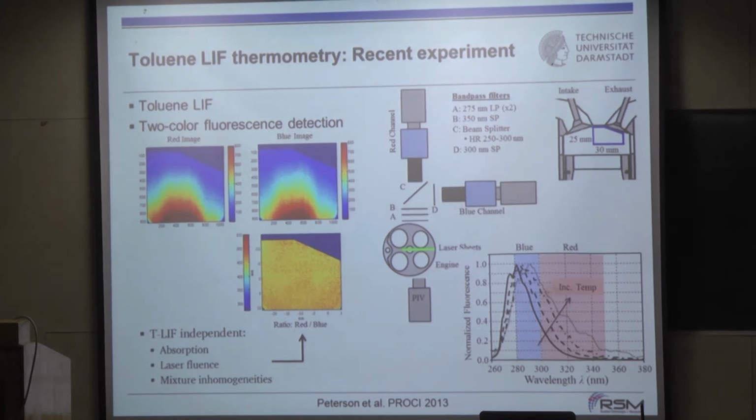And that means that hurts you really. And that means as well, because you have limited dynamic ranges, when you know you are cold, you put in filters. If you know you are more hot, you take out the filters. If you're in between, you have limited, again, due to the dynamic range, you might limit by that your precision. Good question. Yes? Roughly, 650, yeah.